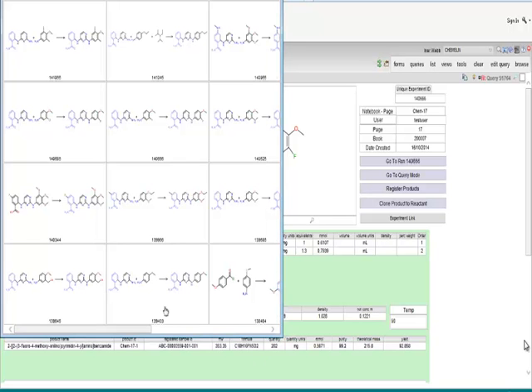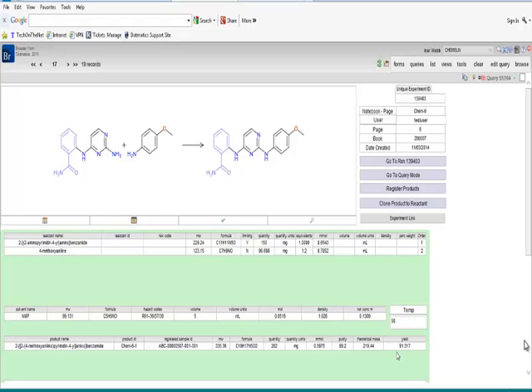And how about I select one of these and use it as a basis for a new experiment? And we can take a look at the ELN itself. So let's look at this one, 90% yield. That looks good to me. Now here, if you notice, I'm logged in as a particular user. This experiment belongs to one of my colleagues. It's not one of my experiments. It's a way of making what we're demonstrating here an incredibly easy way to find out what your colleagues have done.